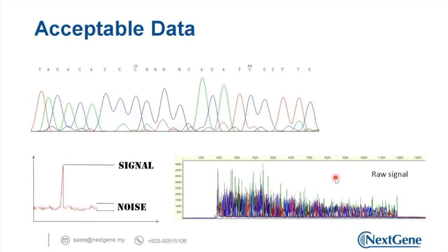In that case, maybe you can contact me, or let your salesperson know. Then they will send your sequencing result for me to see, because I want to know whether the second primer failure is because of multiple templates, and I want to see the signal strength and all that. Okay, I will look into it. Thank you very much. Sure, no problem.